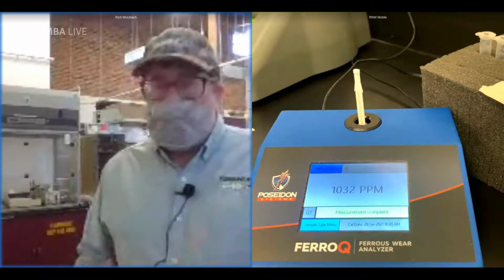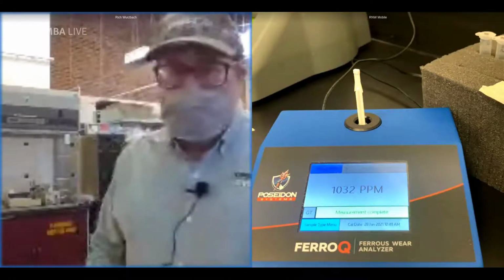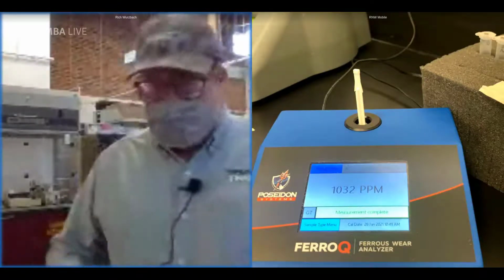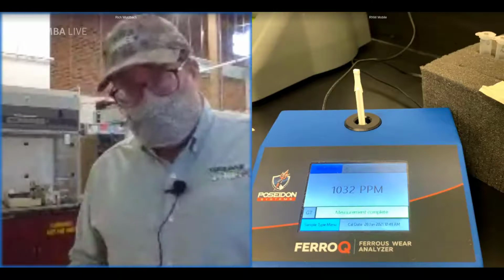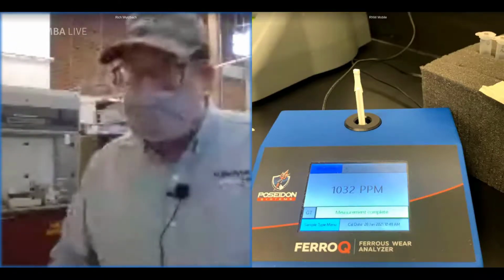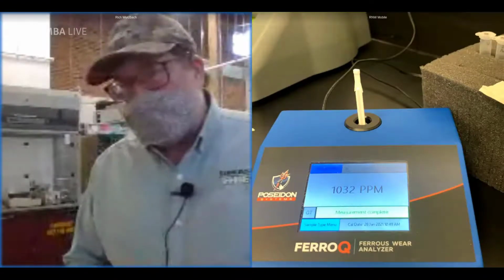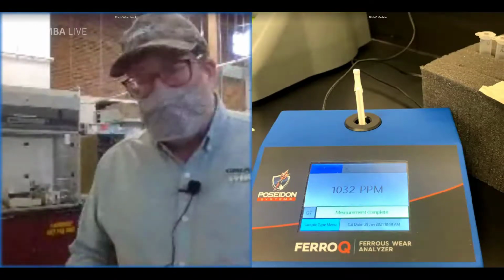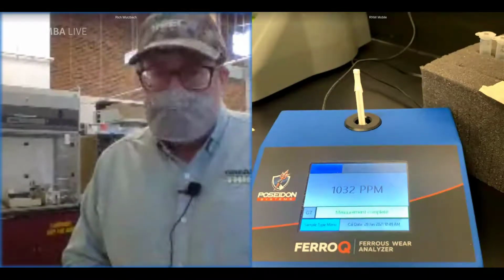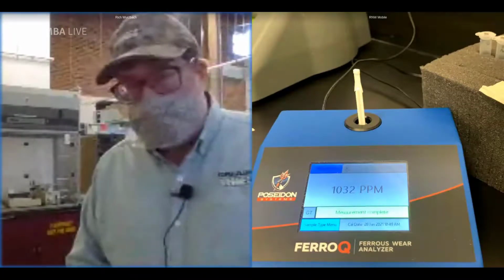I think the best situation is a lab doing the analysis, having experience looking at similar types of customers and similar types of assets, and bringing that to bear, but also the asset owner being able to provide information about the operating cycles and so forth. You bring that together and you get the opportunity to make some really good judgments based on criteria and how to act based on the values that you get.